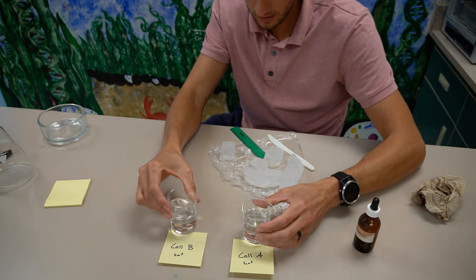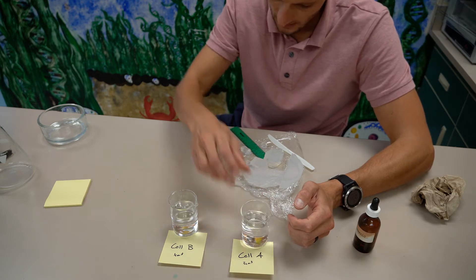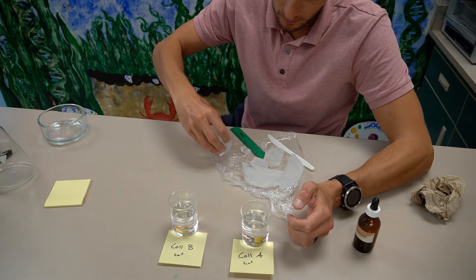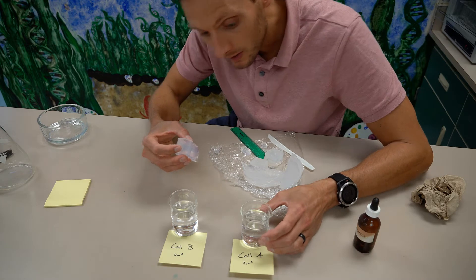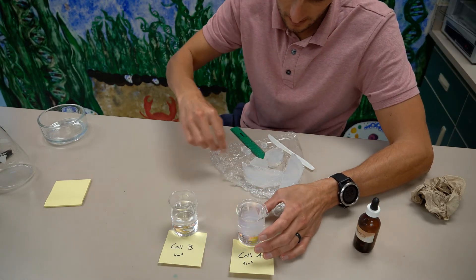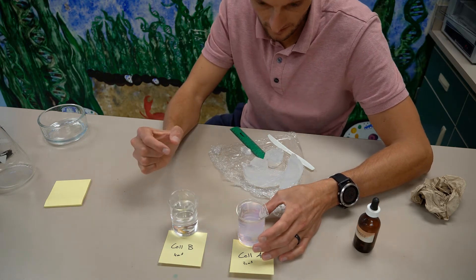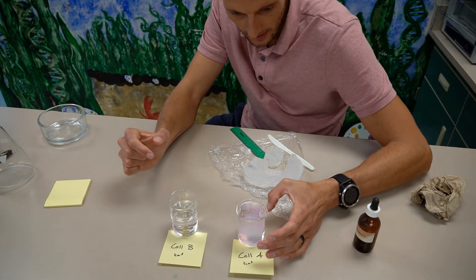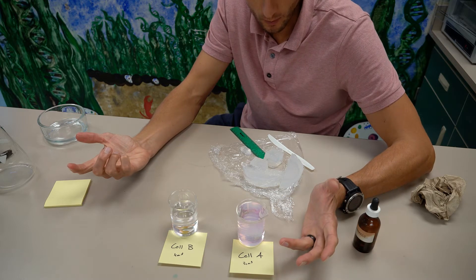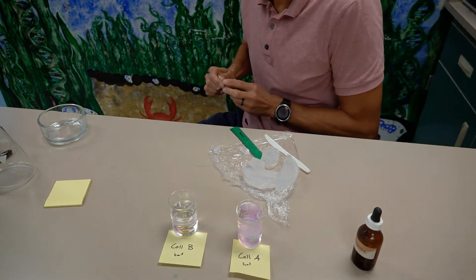I'll give each beaker a little swirl and then go ahead and place the cubes into their containers. You can already see them starting to change color. Now that the cubes have been soaking for 15 minutes, I'm going to take them out to measure how far the pink color — caused by the ammonia reacting with the phenolphthalein — has diffused into the model cell cubes.